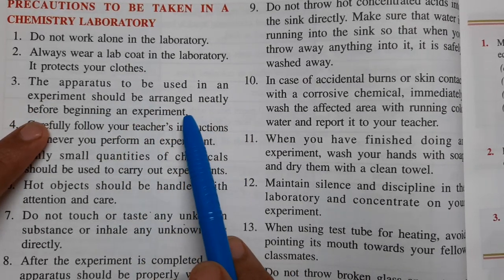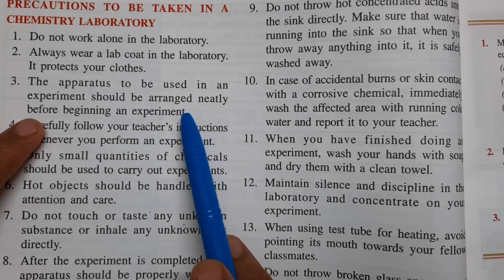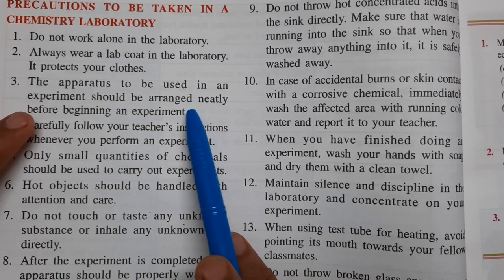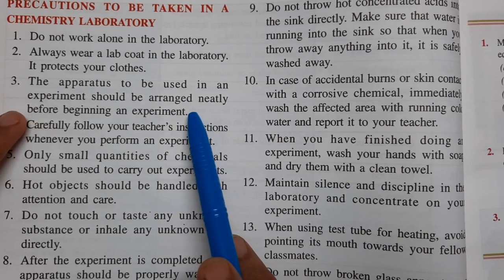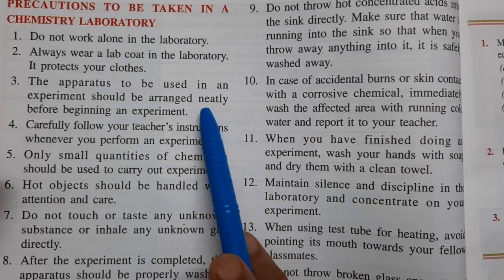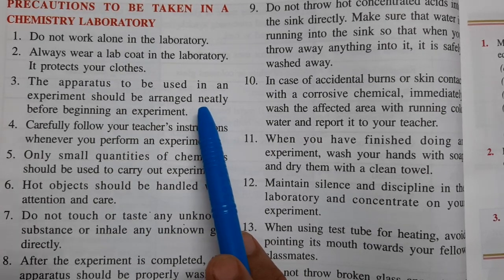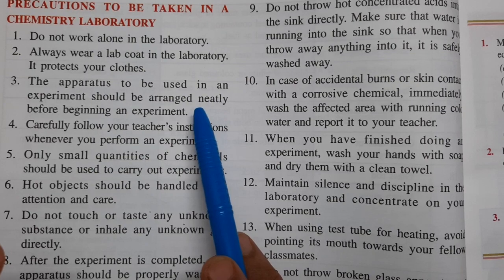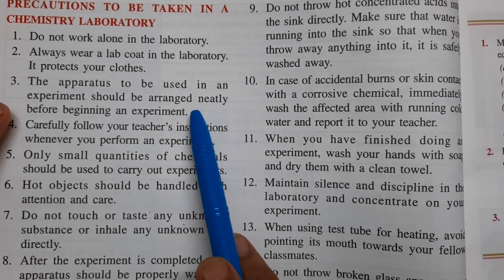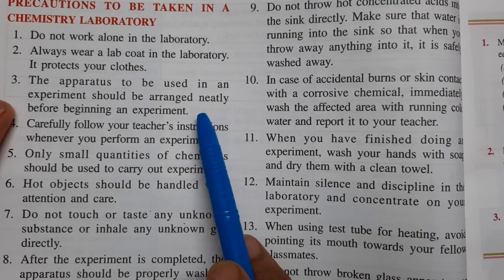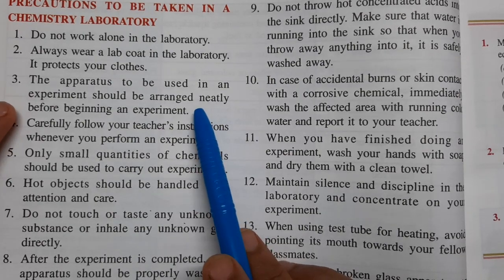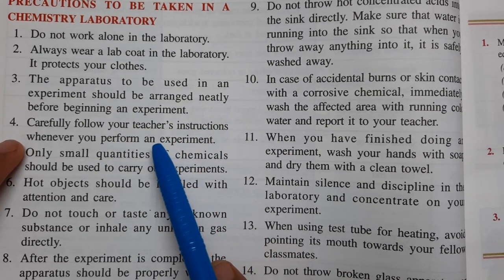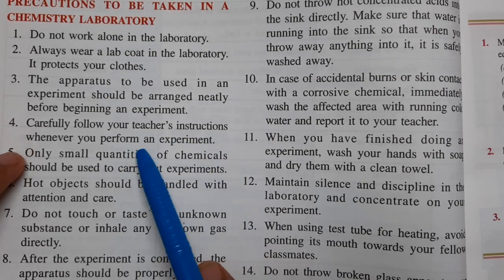Third: apparatus to be used in an experiment should be arranged neatly before beginning the experiment. Whenever we are doing a chemical reaction and need to use apparatus, we need to make it clean and arrange it properly first, and then we can do the experiment. It is always important to arrange everything before starting work.